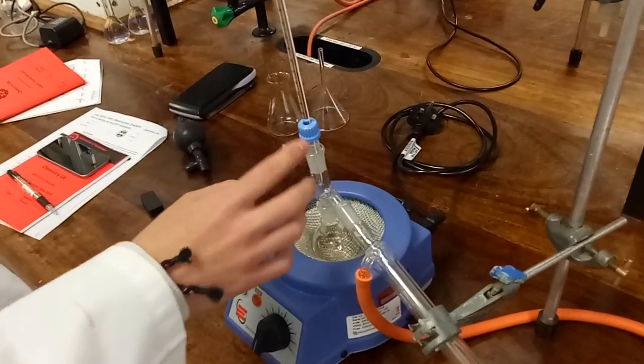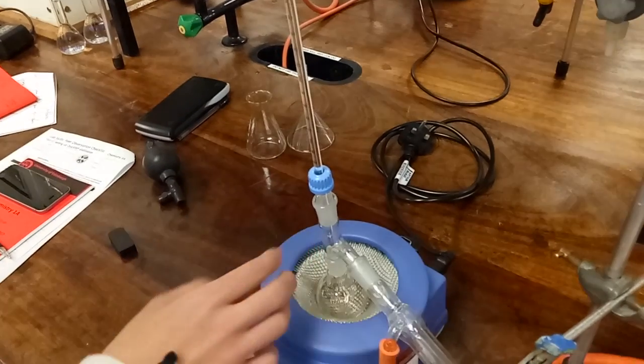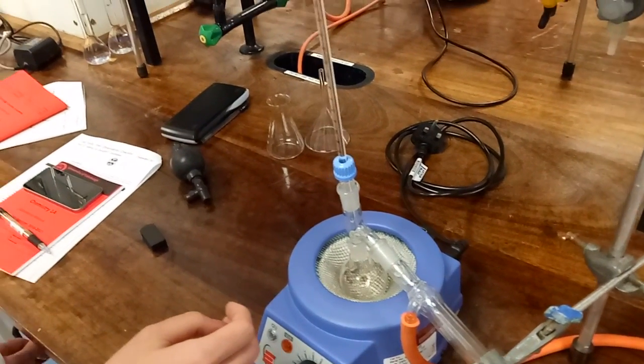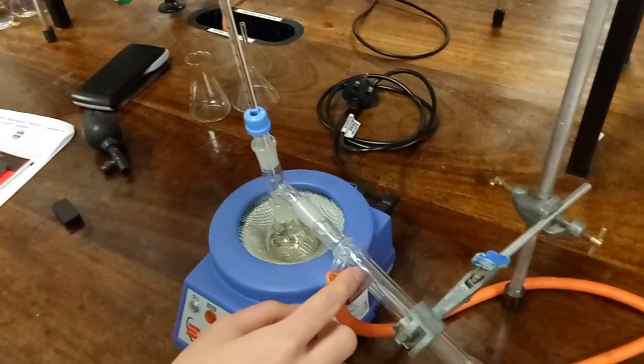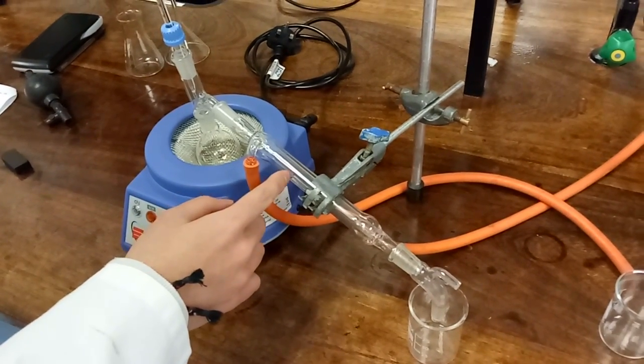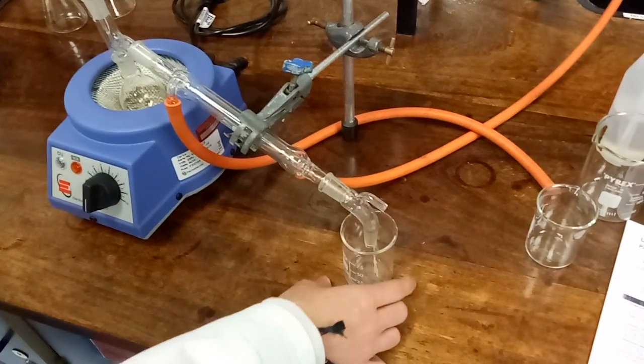Once we see that the temperature has reached a steady point and isn't rising anymore, that means the first fraction has reached its boiling point. At which point, the gas comes through the condenser. The lower temperature in the condenser means the gas will condense into liquid, which we collect in this flask.